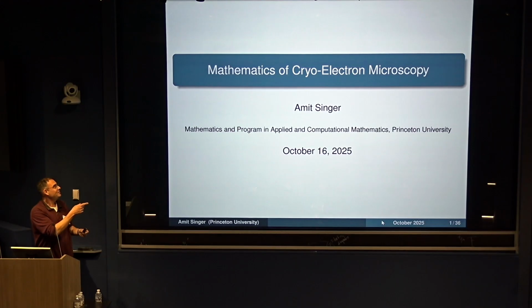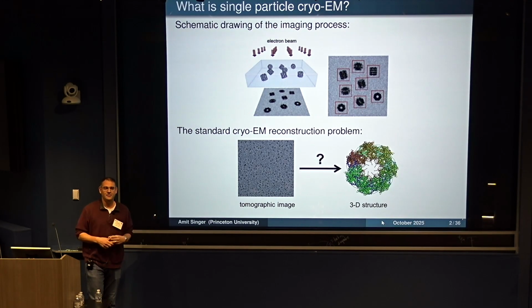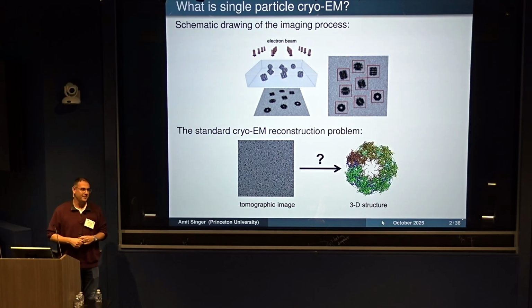I'll start with cryo-electron microscopy, and then we'll go to math. So what is single particle cryo-EM? This is a methodology in structural biology to determine three-dimensional structures of biological macromolecules at high resolution.